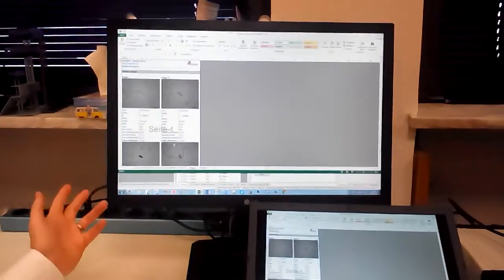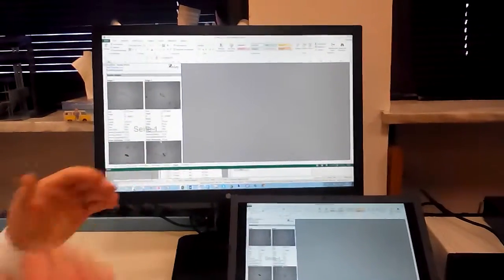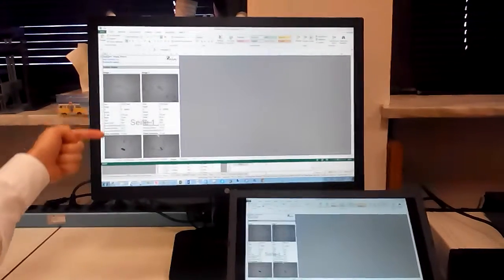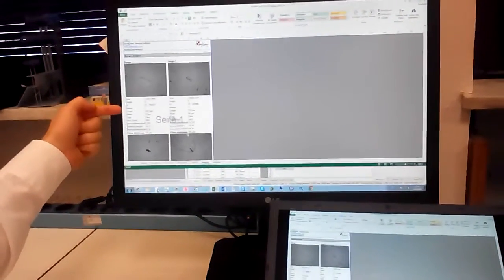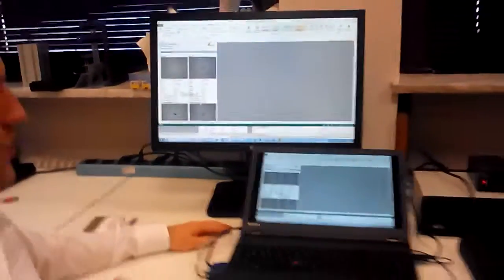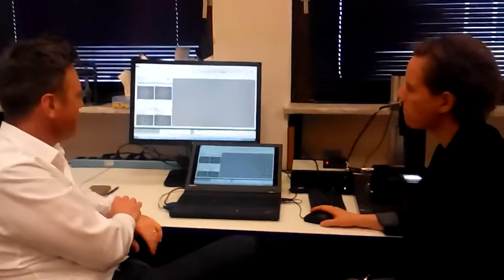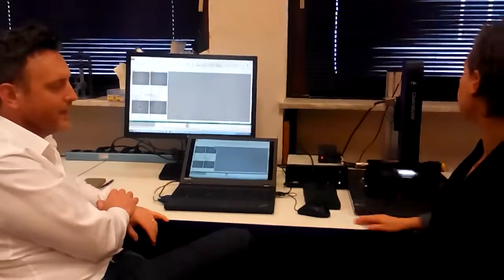And then finally, the images that Karen tagged are also contained here. Whichever particles are marked just after we've analysed will also be included in the report, again with each of their individual attributes: the height, the ID, the length, the width, the type, and all this kind of information. So that's really a summary of the Cleanalyser 5 micron system, one of the market leading systems here in Germany for residual dirt analysis and cleanliness verification.